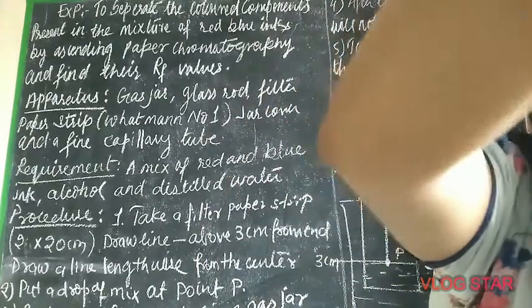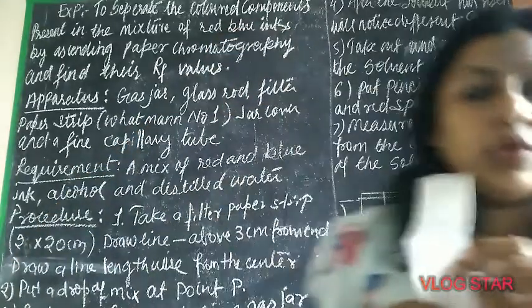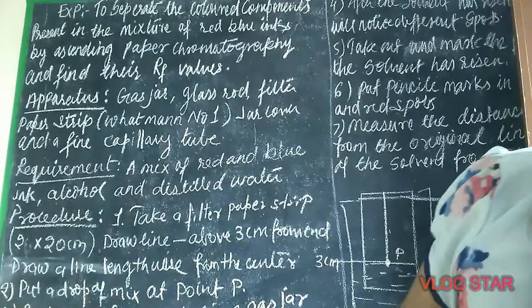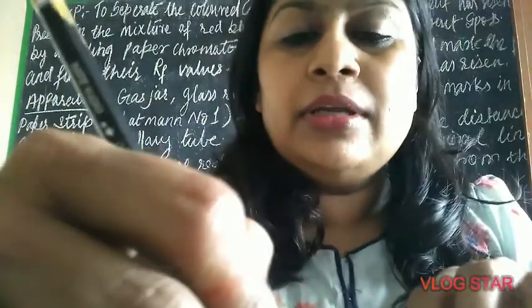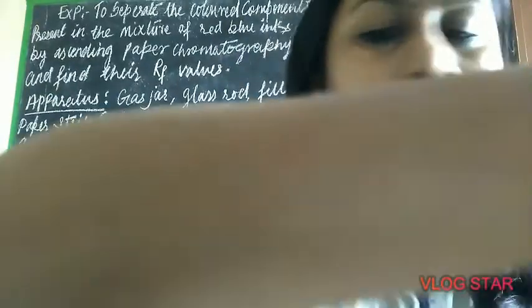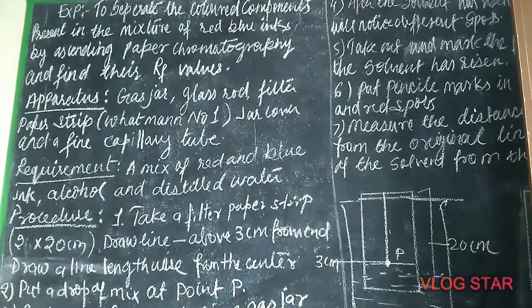Mark three centimeters from both ends using a scale and pencil, then find the center point. Where both measurements meet, that will be your point P, where you have to put the drop of the mixture.